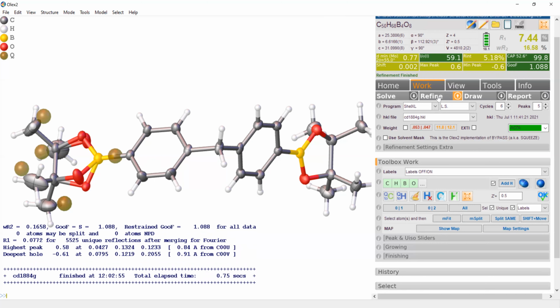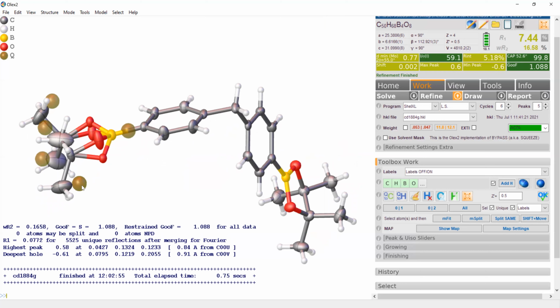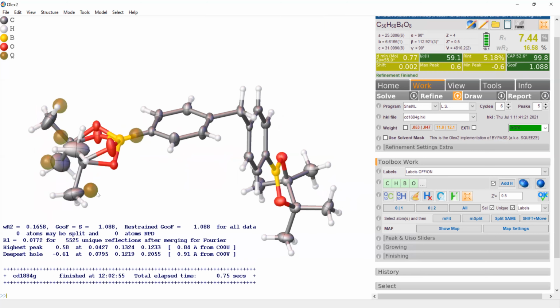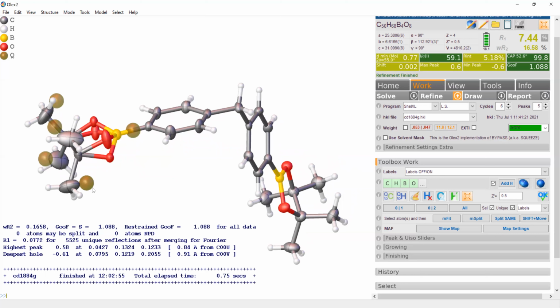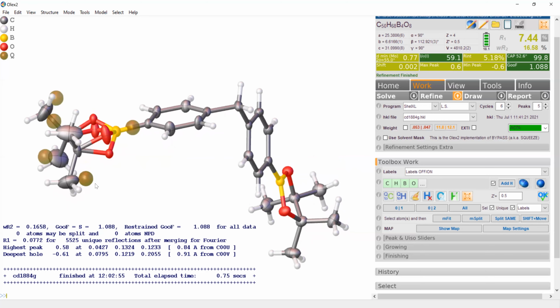So it's looking good. Now the other error that we were dealing with was this electron density peak near this carbon, because this is the highest one. It's saying, hey, you need to address and determine what this could be. And so one thing it could be is that this methyl group is disordered. So maybe, remember this oxygen O1 is 40% occupied. Maybe this carbon here, this electron density peak, represents a methyl group that is 40% occupied.